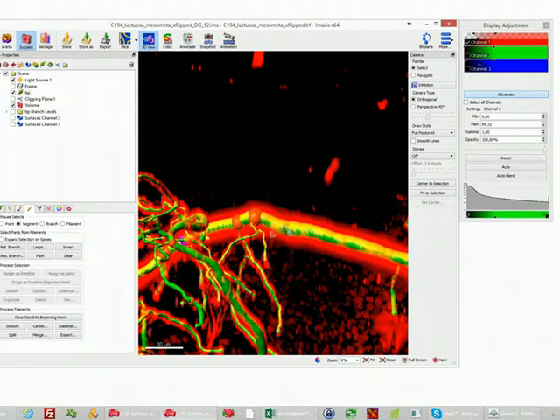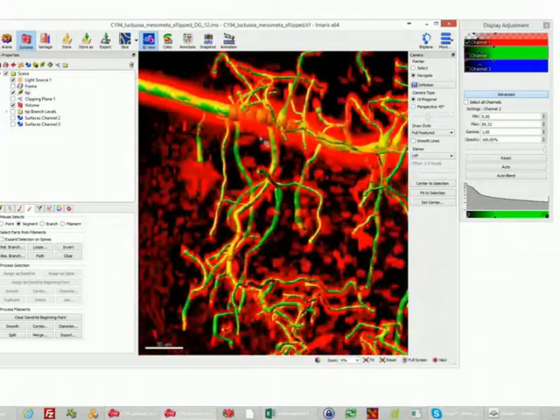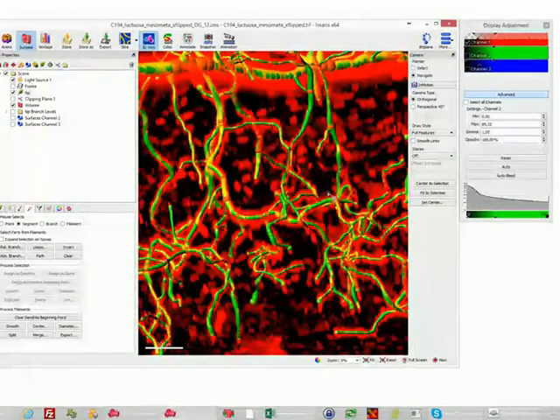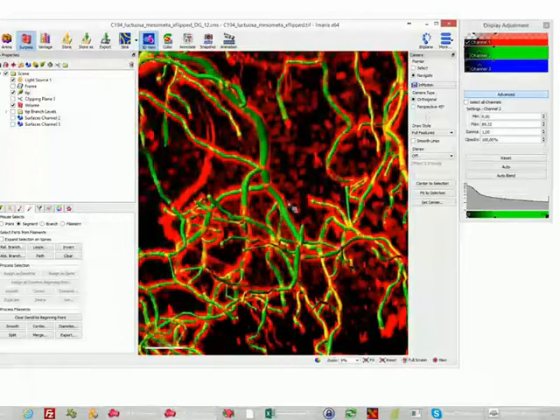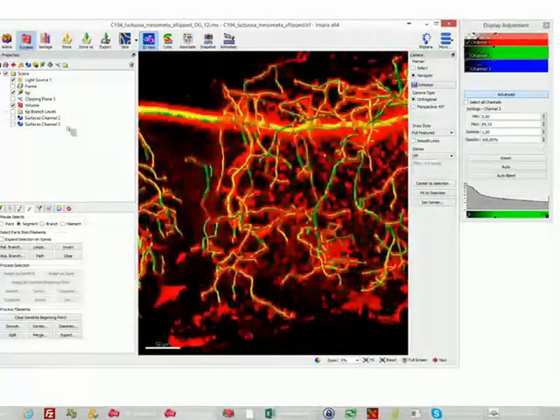So this is, of course, not really challenging, selecting objects and then deleting them. A little bit more sophisticated is a tool to manually draw. So first I have to find the location where I have these, which is missing.